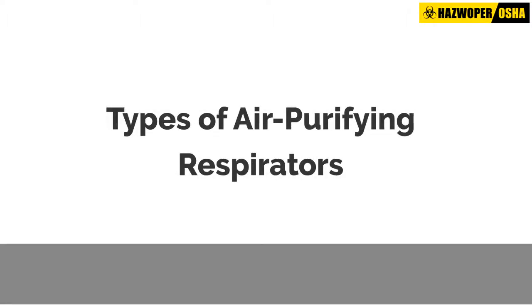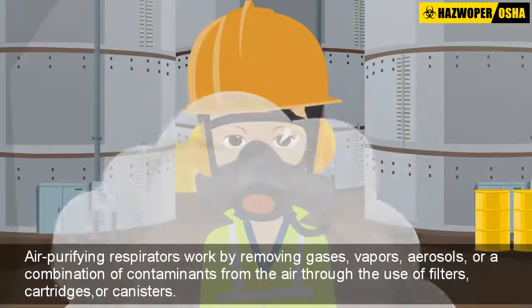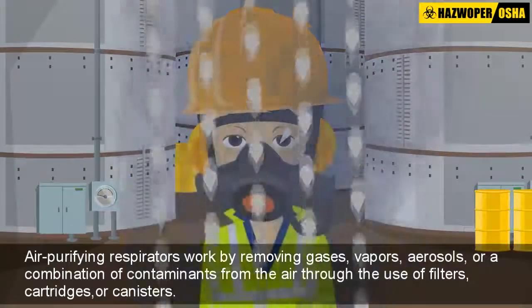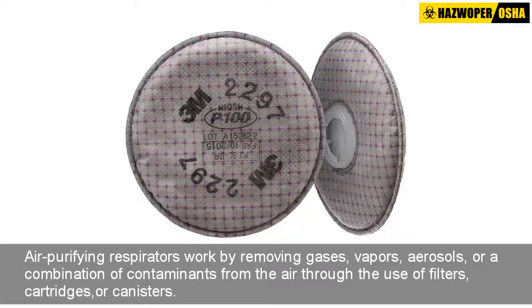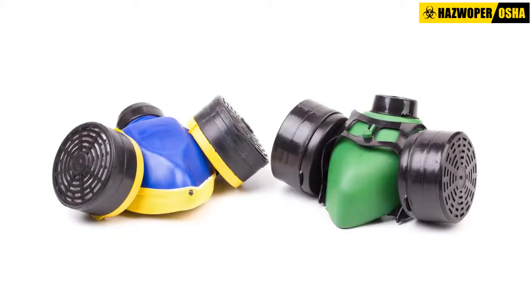Air purifying respirators work by removing gases, vapors, aerosols, or a combination of contaminants from the air through the use of filters, cartridges, or canisters. These respirators do not supply oxygen from a source other than the working atmosphere.